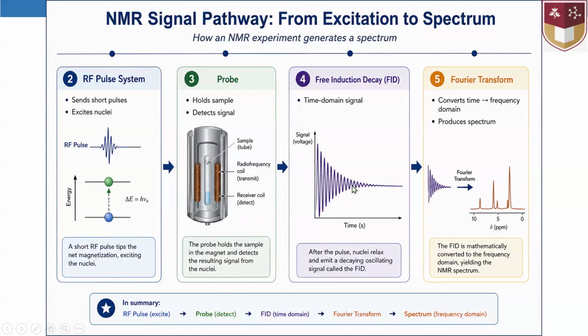Those emissions, termed free induction decay, are obtained, and they are transformed into this kind of signals by using Fourier transformation, right?